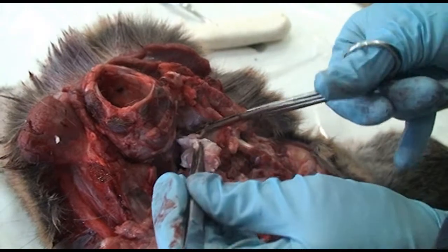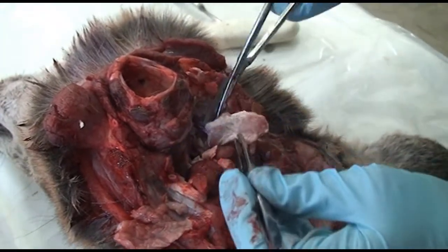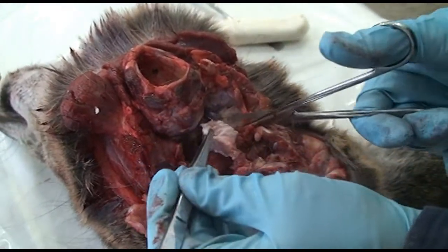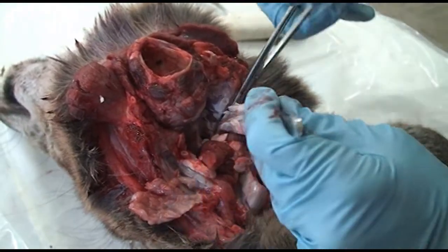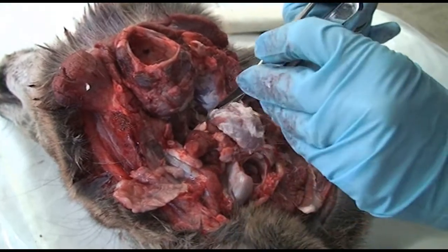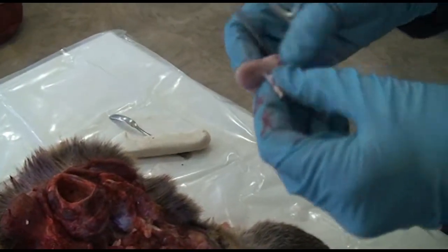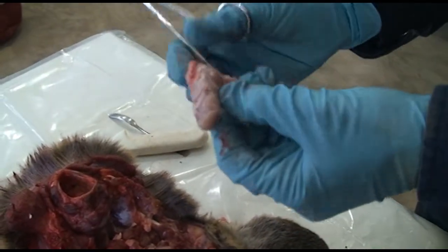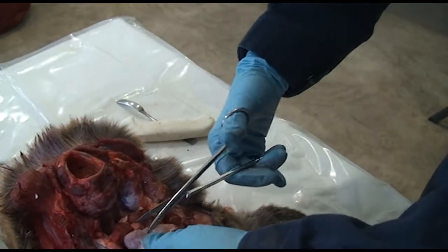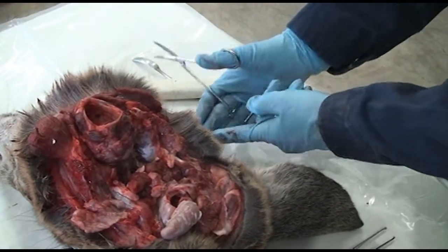But the older the deer gets, the smaller the lymph node becomes. This is a pretty typical size lymph node on a 2-3-year-old deer, which is what I would guess this buck was. But on older deer and elk, the lymph node can be the size of a pea. It can be very small, and it's much harder to find. And so again, we have an oblong, somewhat kidney-shaped lymph node. Cut off some of the excess connective tissue off of it.